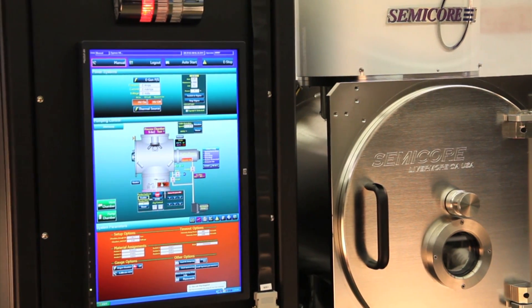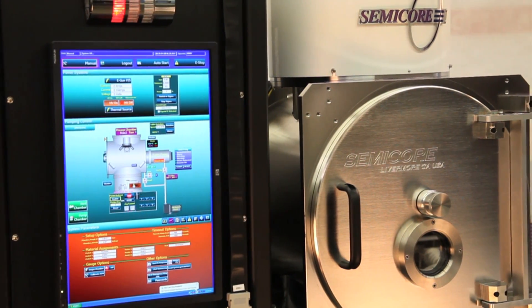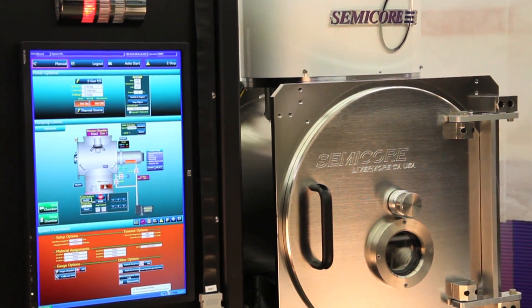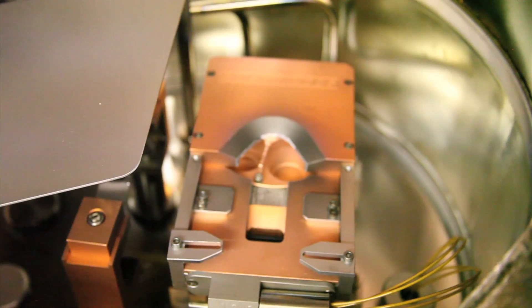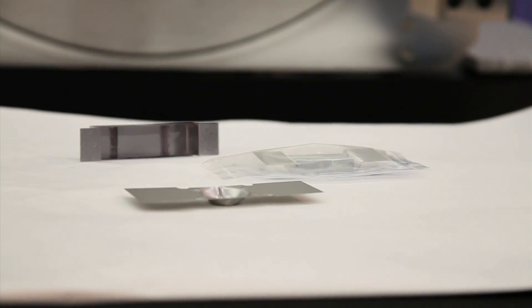The primary source is a six-pocket, six-kilowatt electron beam gun, and the secondary source is a two-kilowatt filament boat.